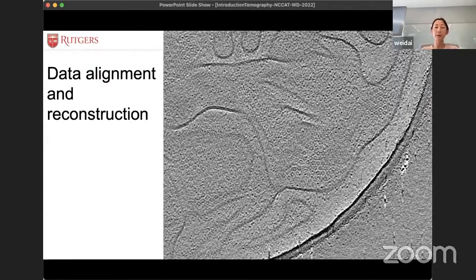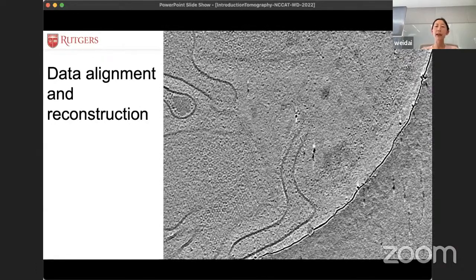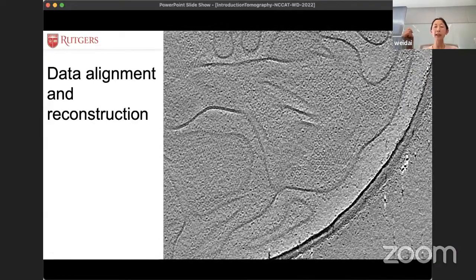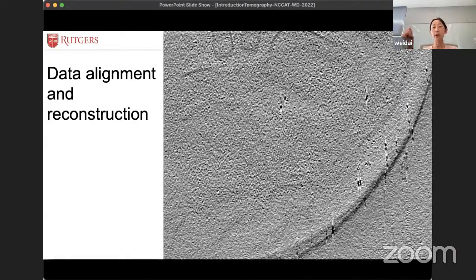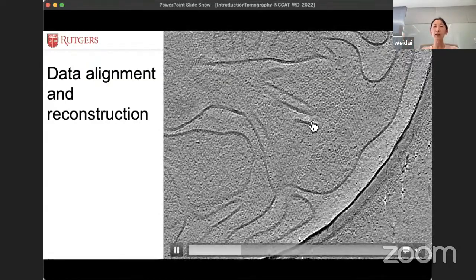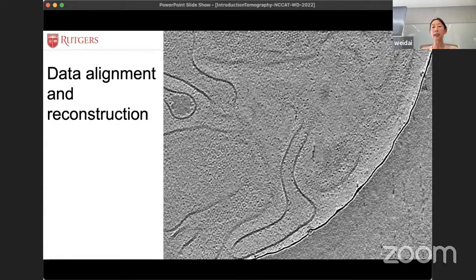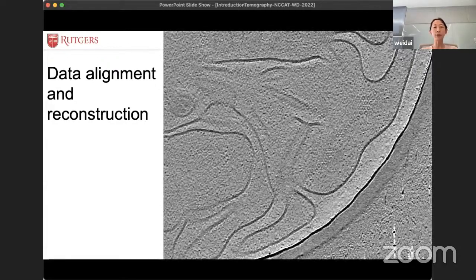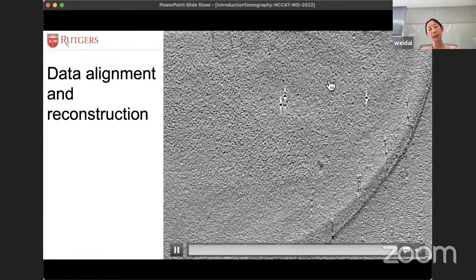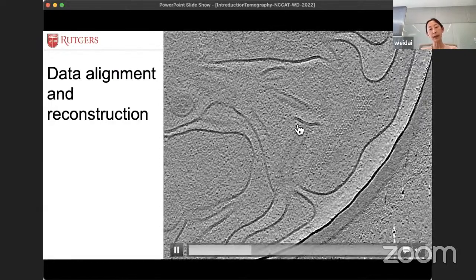They are the membrane proteins that catalyze the biosynthesis of glucan. Glucan is one of the major scaffold components of the fungal cell wall, okay? And also this particular enzyme is the drug target for echinocandin drugs. Okay, that's why I'm interested in it. You can see they're still in membrane embedded form, and then they seem to form clusters, right? The little donuts, little flowers.